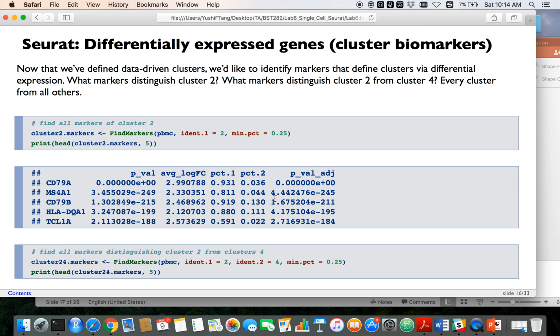The first step might be to find some statistically significant identifiers, which we call cluster biomarkers, for each cluster. These are actually what I would call signature genes. These genes might come from some specific cell types, which means they are expressed differently in this type of cells compared with all other cell types. So first, we have to find these biomarkers, and then by using the biomarkers as the bridge, we can match all our clusters to the target cell type.